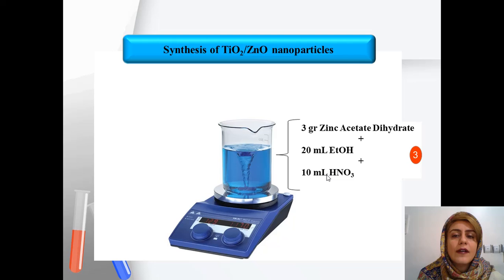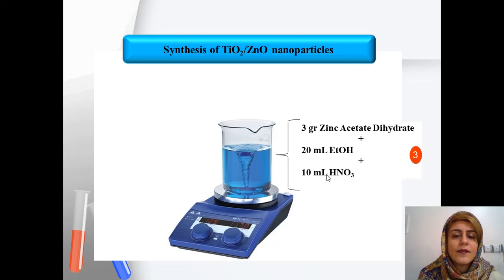Next, the solution of the second precursor is produced. The second precursor is zinc acetate dihydrate. For this purpose, three grams of zinc acetate dihydrate is added to 20 milliliters of ethanol and 10 milliliters of nitric acid, and this solution is stirred for about 30 minutes.